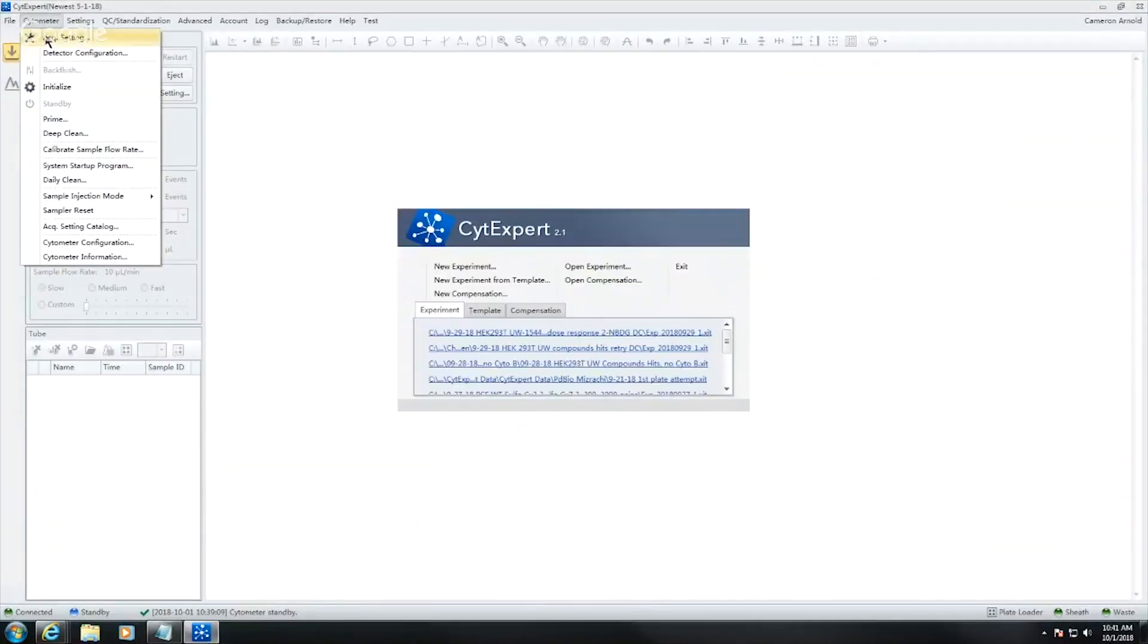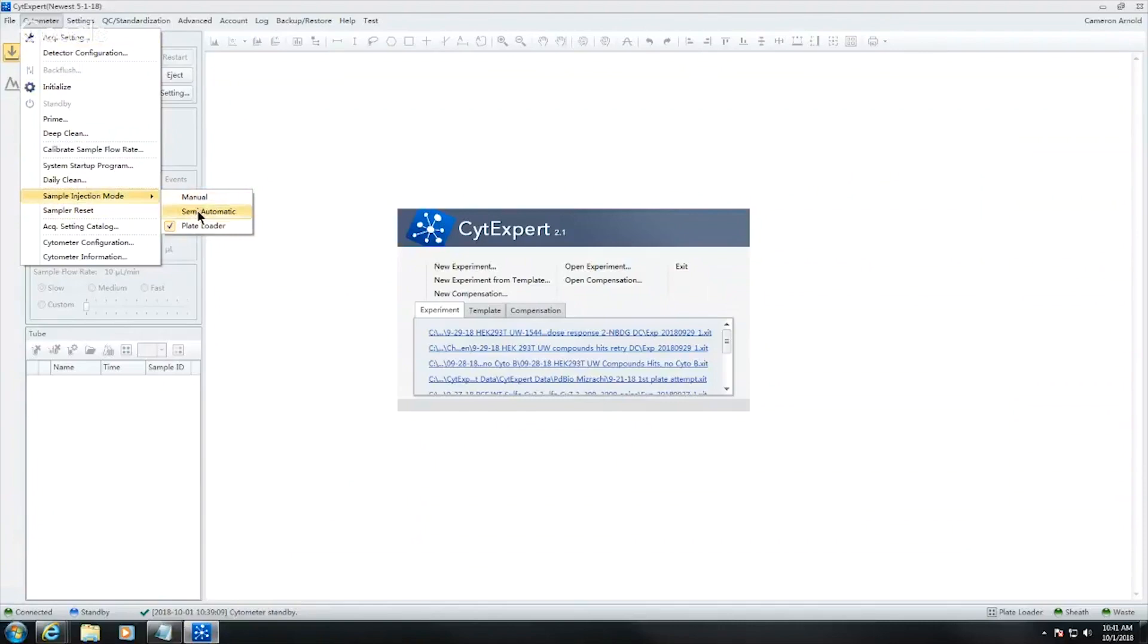Go to Cytometer and Sample Injection to select, for fax tubes, semi-automatic, or for 96 well plates, plate loader.